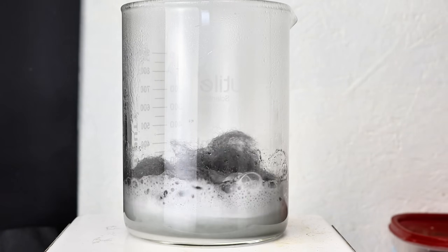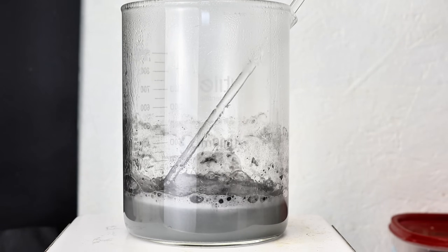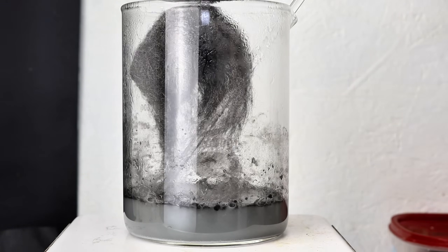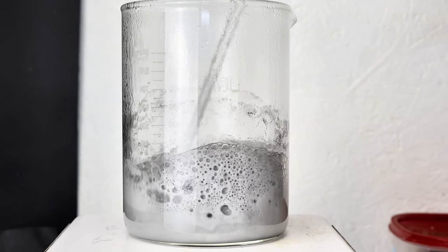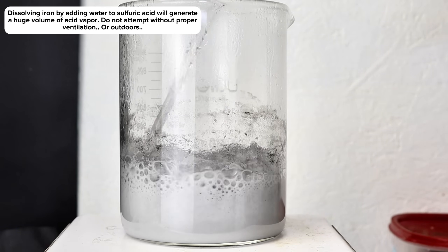With respect to my specific procedure here, I decided to simply add some steel wool to a beaker followed by some concentrated sulfuric acid. I then periodically added very small amounts of water, which resulted in a highly aggressive and exothermic reaction. However, this isn't the only way to go about this reaction, or even the best way, depending on what kind of protective gear you have access to.